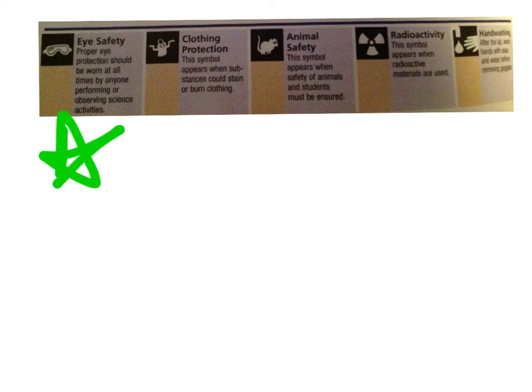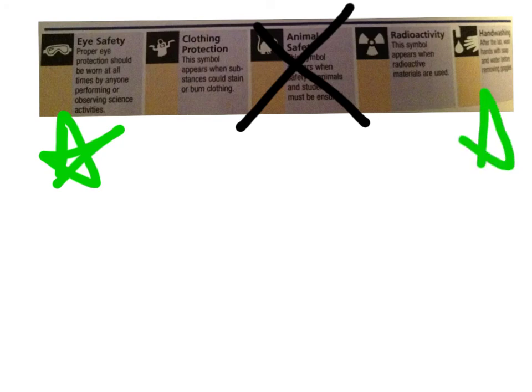Animal safety is not one that we are going to have to deal with because we do not deal with any animals in chemistry at all. Radioactivity as well. We don't use radioactive materials because of safety guidelines, so you're not going to see that one. And then the last one is hand washing. And that one, after the lab, wash hands with soap and water before taking off your goggles. So that is going to be the other one that's going to be of importance from here.